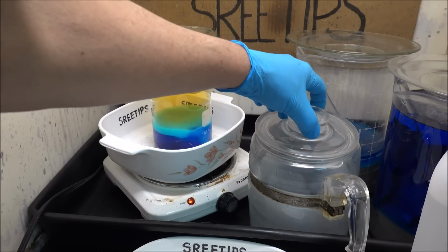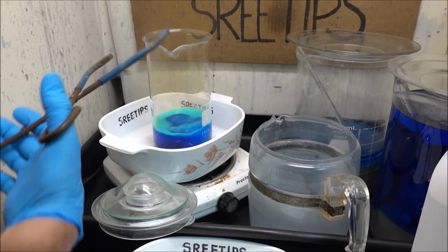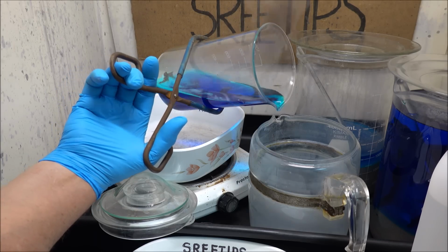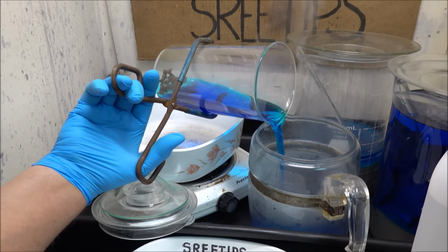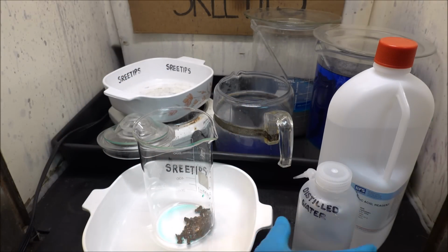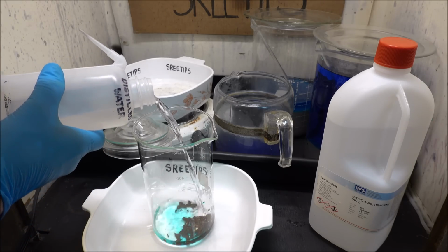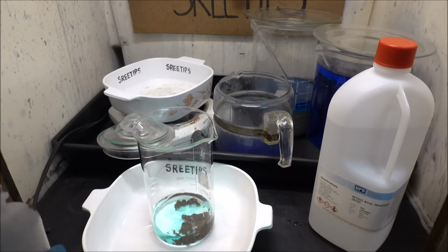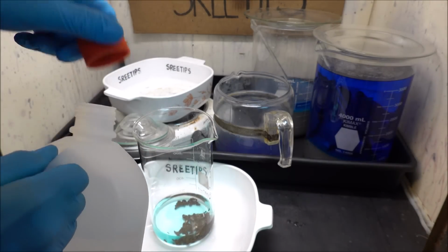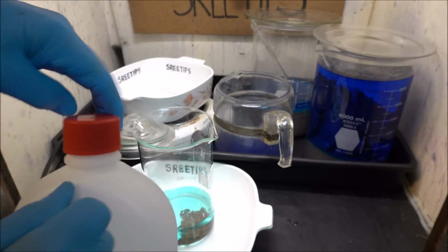This has been sitting in the hot dilute nitric now for about an hour. What I'm gonna do is pour this off now, and I'm gonna save this because this will contain some silver. Now we're gonna add some fresh distilled water here, another couple of 100 milliliters, and I'm going to put in some fresh nitric acid here, same amount. We'll keep dissolving out the rest of this copper and the other base metals that are in here.